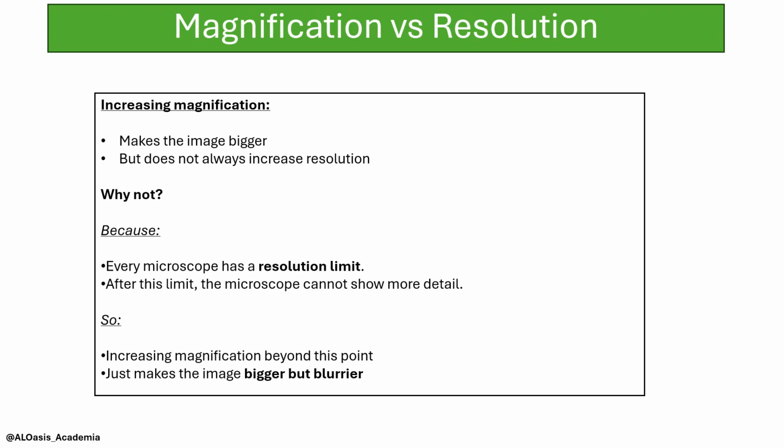And that's why, as we said, increasing magnification beyond this point will just give you an image that is bigger but blurrier. Okay, so magnification and resolution are not the same thing. You need to understand this concept.